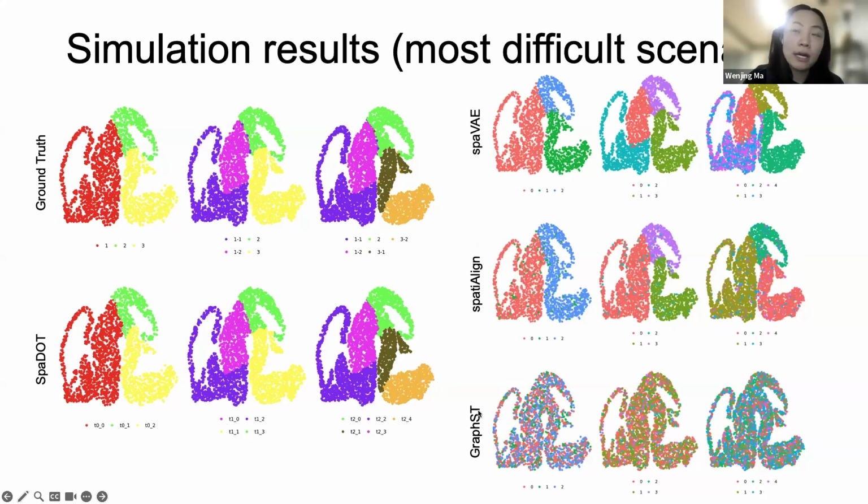And I'm also using another method as an example of an underperforming method. For this one, it basically just detects the cell type information instead of the domain information. As I showed earlier, if looking from a cell type perspective, it will be just randomness in this simulation data.